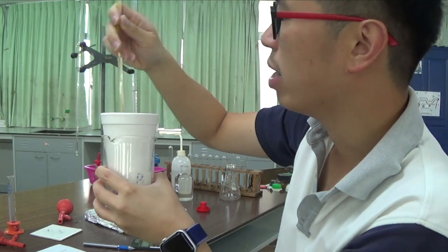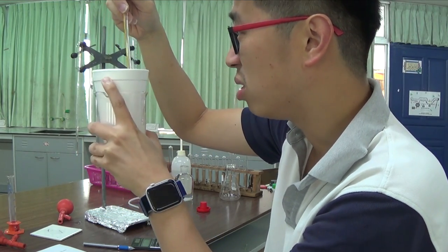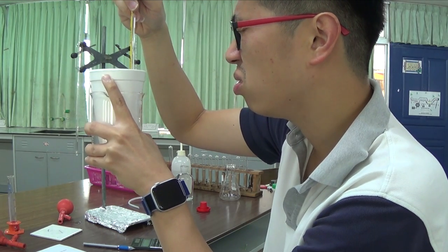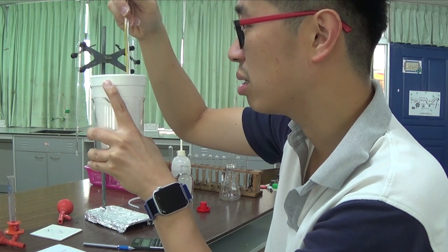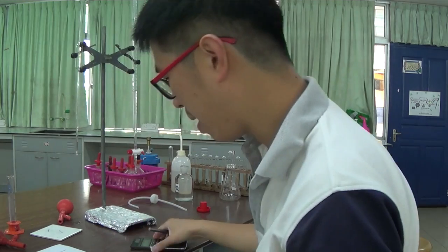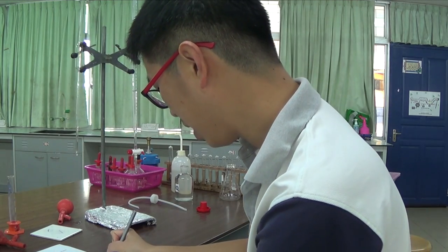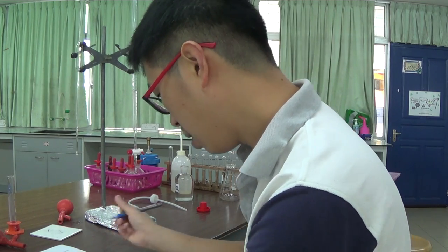But whatever you do, yeah, okay, these things are straight from your experiment. What you do, not what I'm doing here, but what you do. So that is 32.0 degrees Celsius. It doesn't seem to go up anymore. 32.0 minus 22.0, so that is 10. But then 10 on your calculator is not to one decimal place, so it's 10.0 degrees Celsius.